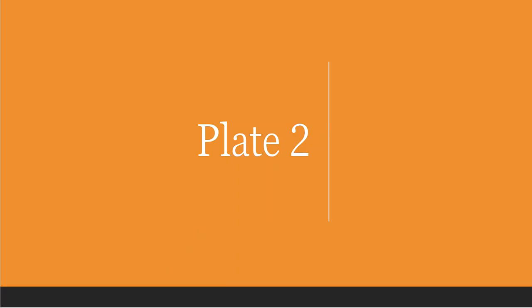And then finally, plate number 2 was the last one to get ready. So I went back to plate 2. Even though I've done this in sequence, I do want you to realize that they all pretty much were taken out about the same time. Plate number 2 was stopped a little bit further down. Remember, this was a damaged area here. I didn't want to include any of that. So I wanted to go 1 to 2 centimeters below that. So that's where the wetness line and the dry line is going to be. So once more, I took my pencil, I just drew all the way across it, so that way we would not lose the mobile phase line at the end.